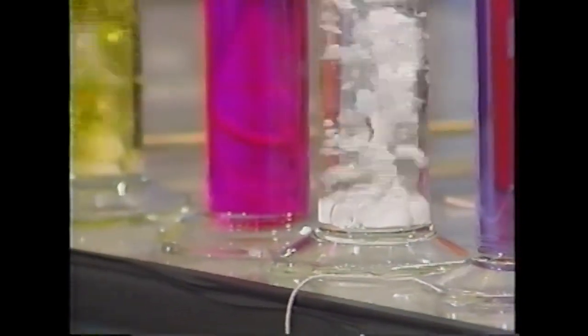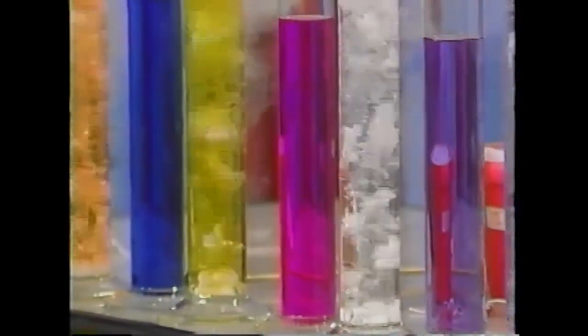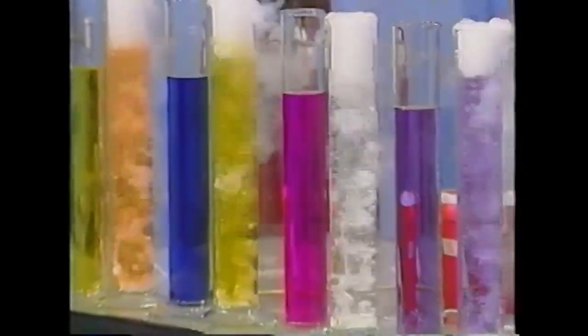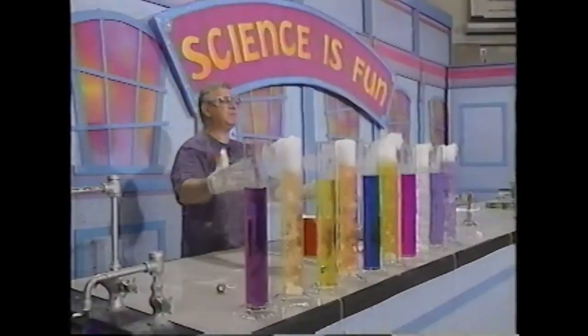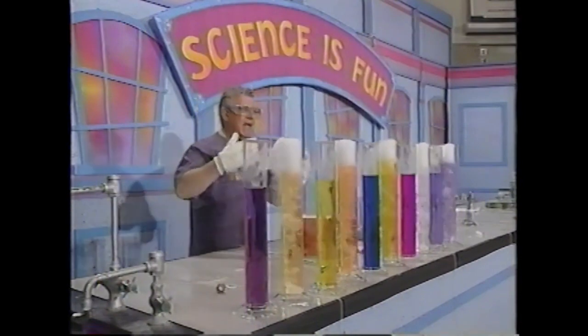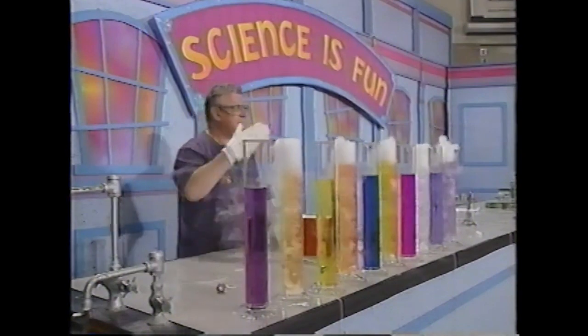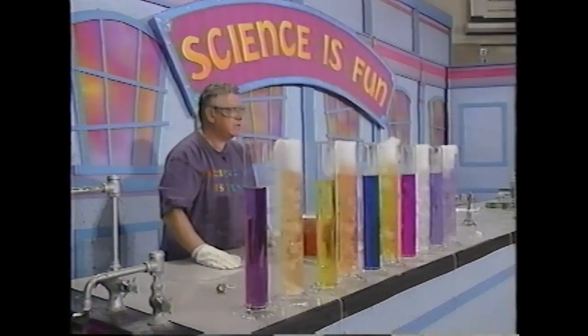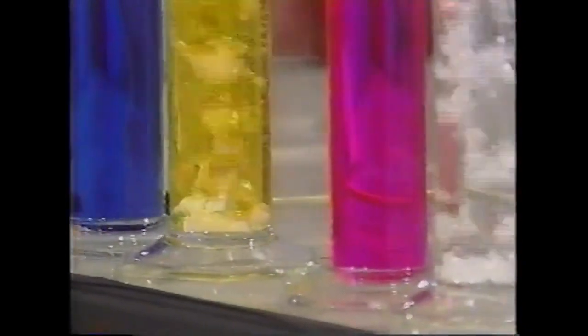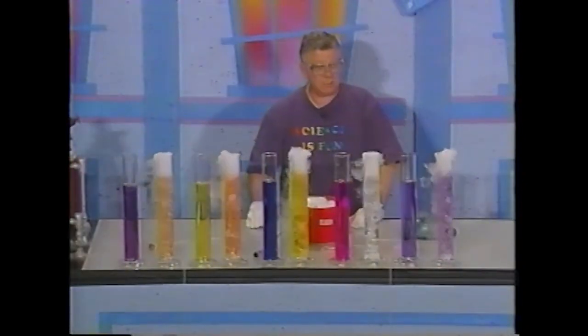You can also see lots of other interesting things happening, right? Their color changes, and there are beautiful bubbles. And you know, the brain absorbs all kinds of information through the eyes, and through the touch, through the skin, through the nose, through the ears. But the brain can't keep up with all of the information that we're getting. That's why I've organized this experiment in pairs, so you can go back and see what the original color was before the dry ice was put into it.